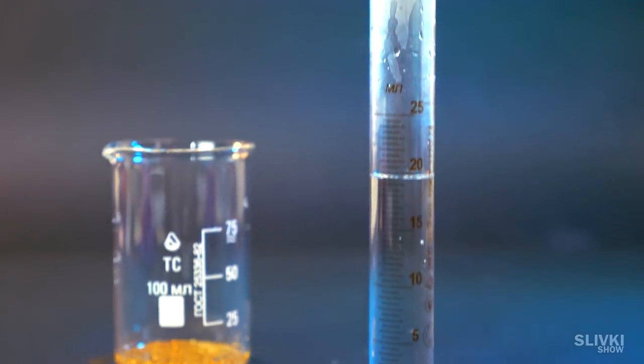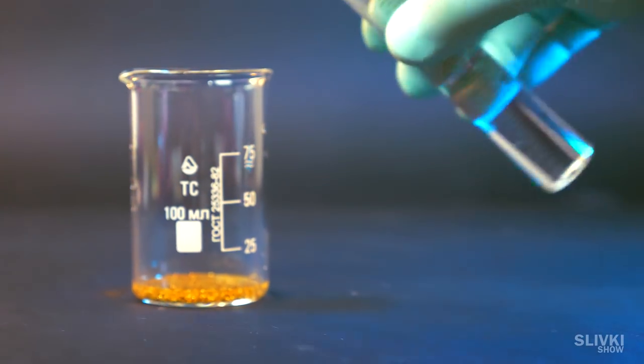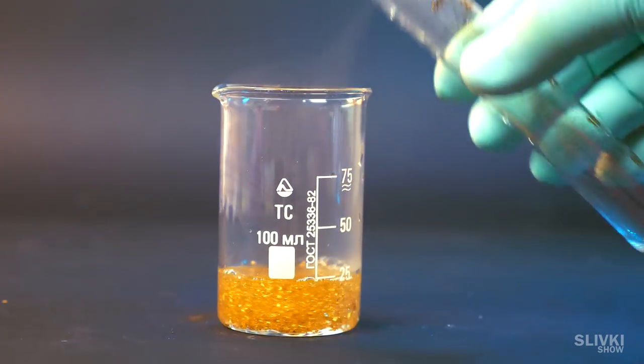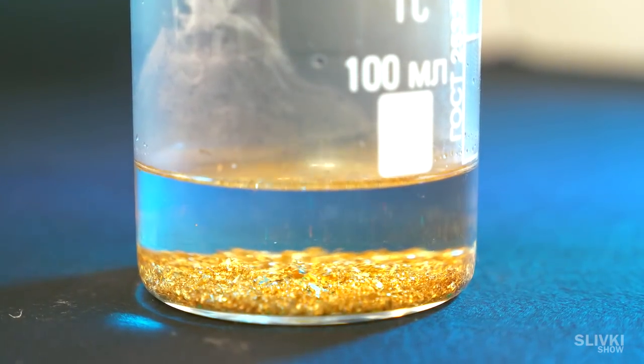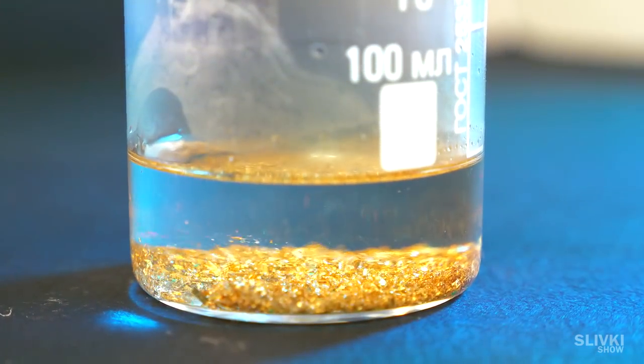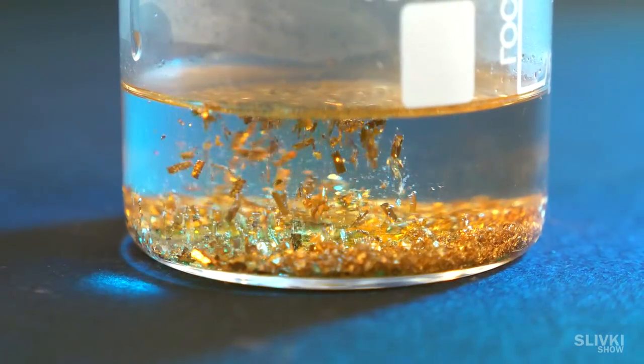Now, we got to take about 20 ml hydrochloric acid, pour gold, and add there drops a little bit of nitric acid. Because its excess will bother it in the future.